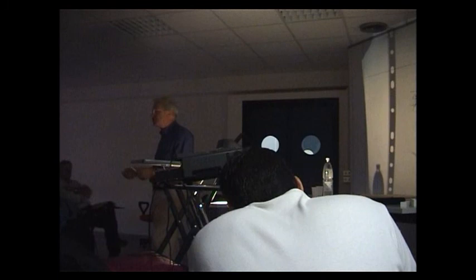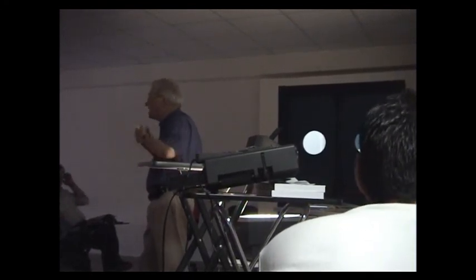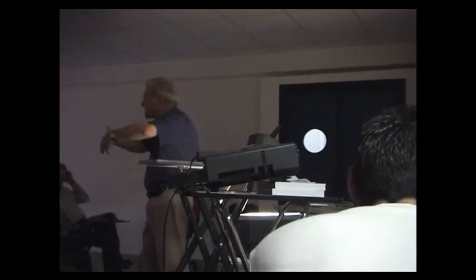As in the air, you have also ions. You have several ions, negative and positive ions in the air. When you irradiate the material with positive particles, it's possible to remove electrons. Then we have a charge of the samples if the sample is an insulator. If this insulator is irradiated with charged particles which are positive, protons, we add positive charge, and you remove negative charge by ejecting electrons, then you increase the positive charge on the sample itself.